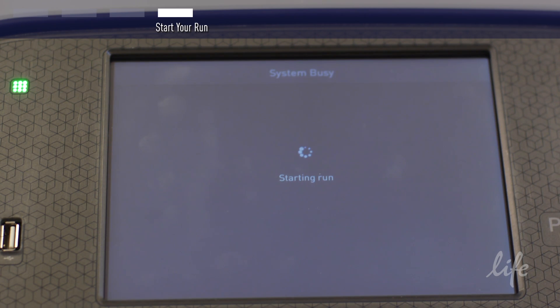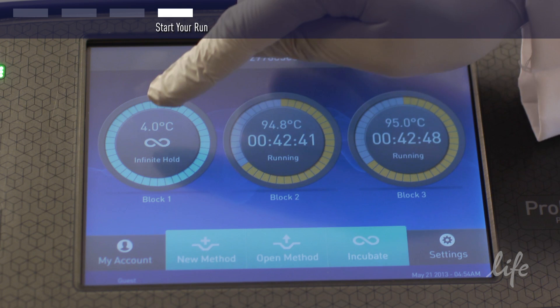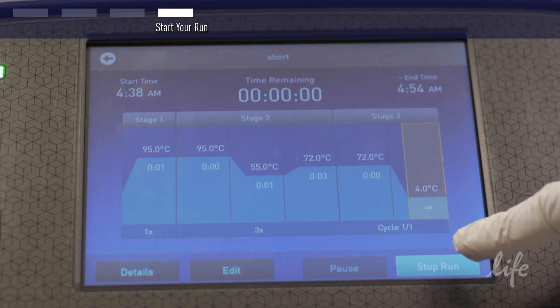You can monitor your run as it is cycling. When your run is complete, you can choose to end it or set it to incubate.